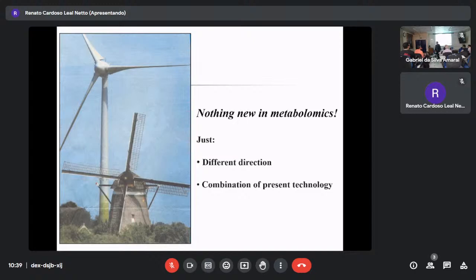And second, instead of chemotaxonomy or a physiological approach, I'm interested in foodstuff, like orange juice. Instead of orange, I'm interested in orange juice. In this orange juice, the main part is orange, but there are also artificial compounds. Then an extract can be used depending on your goal. Whether an extract is allowed or not is important.